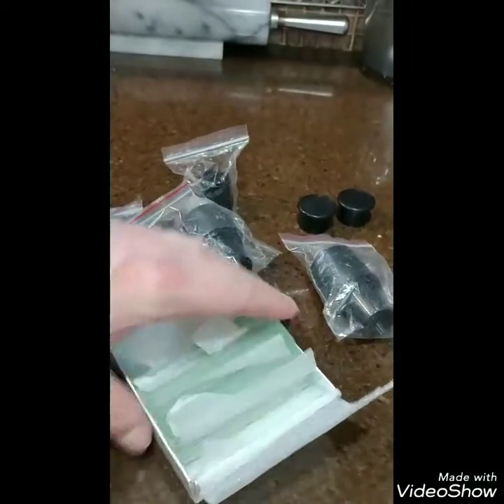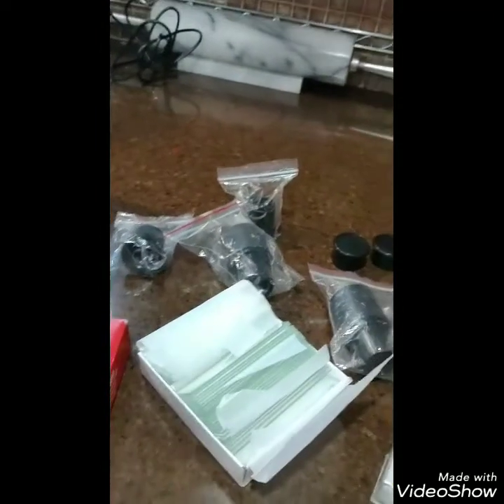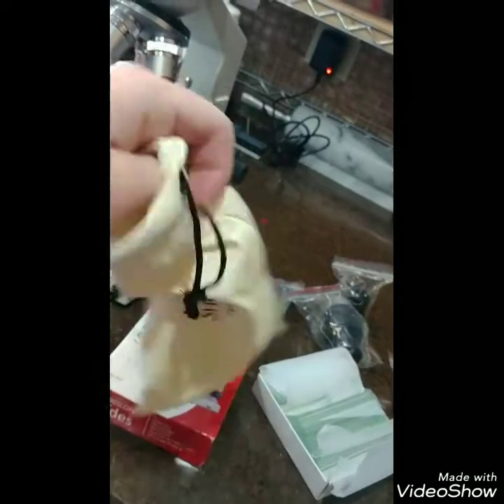I'll admit I'm not good at not getting dust on things, so what I do is I clean off my lenses, slides, and slide covers with one of these — it came with my eyeglasses. I just wipe everything off.